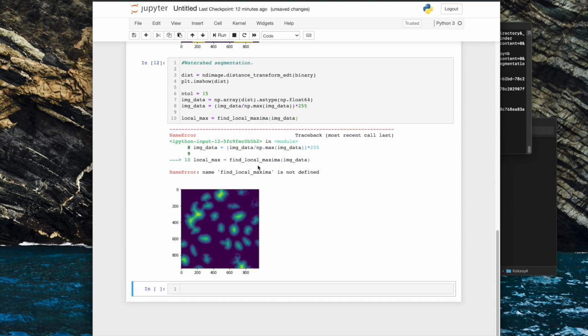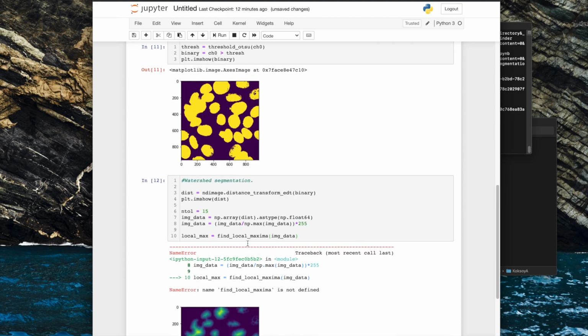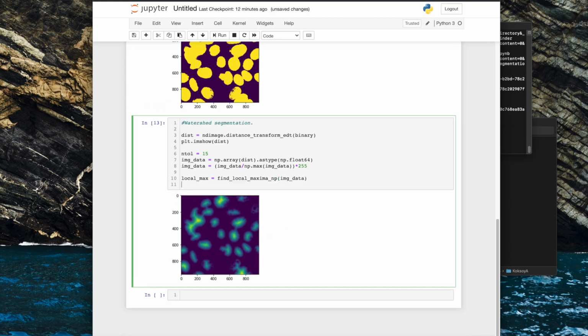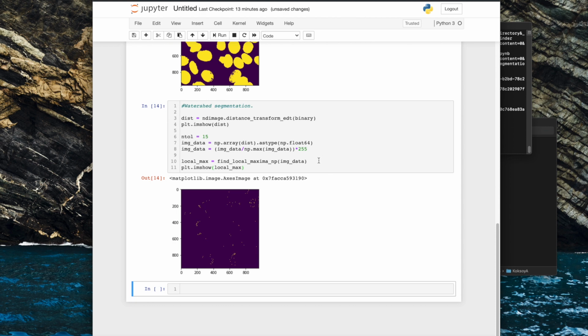And then the algorithm that I have will prune those and just bring out the more prominent ones based on the noise tolerance. So this is like a pre-processing, and then we'll just plot that data so you can see it. And I'll make it a bit bigger.